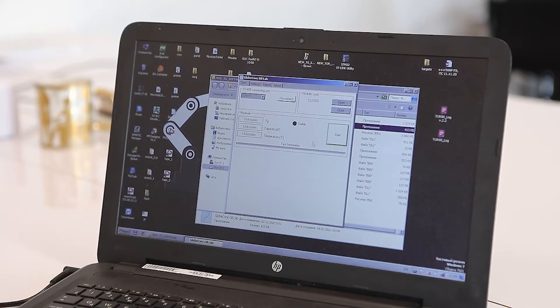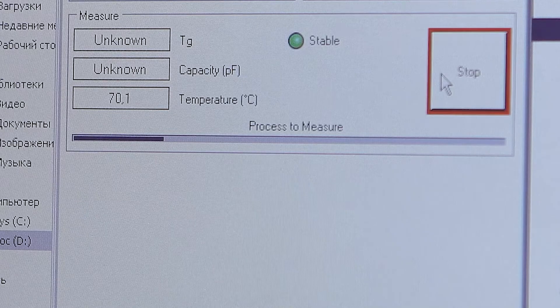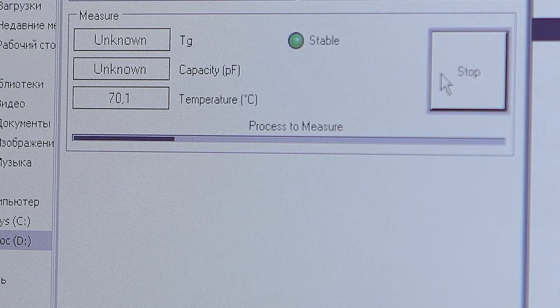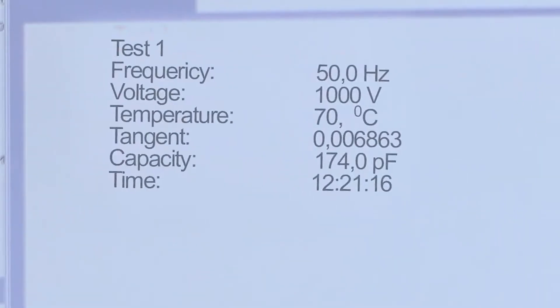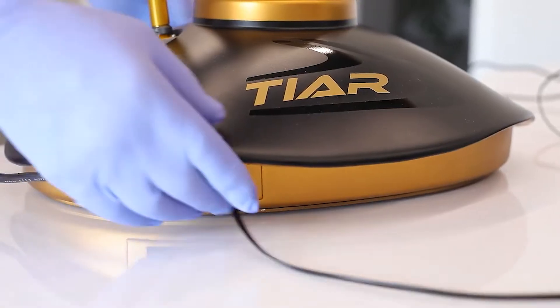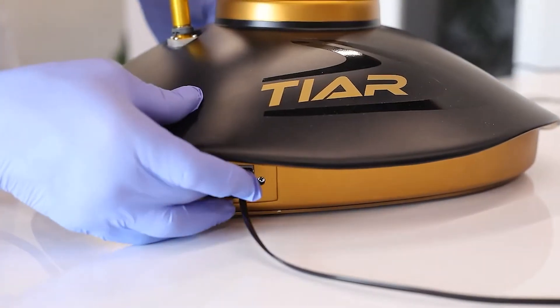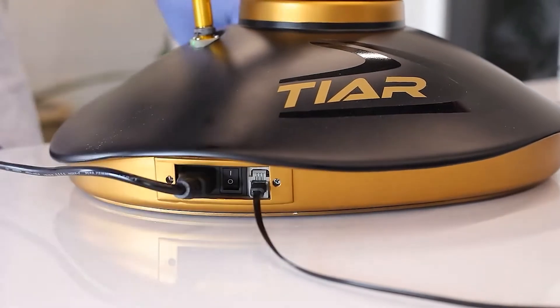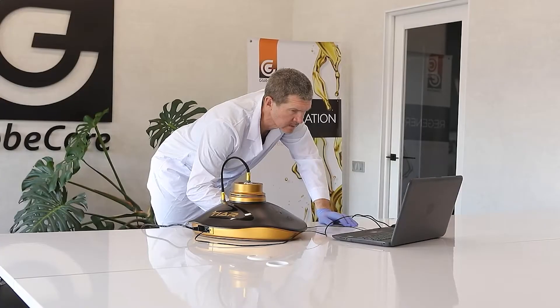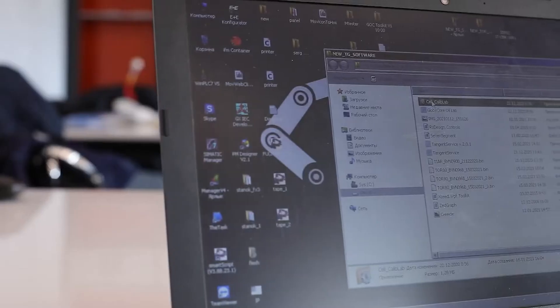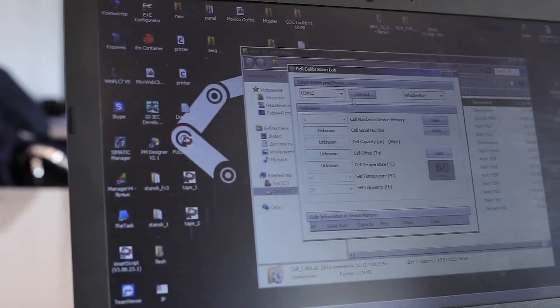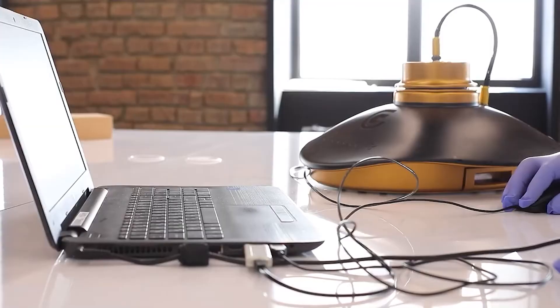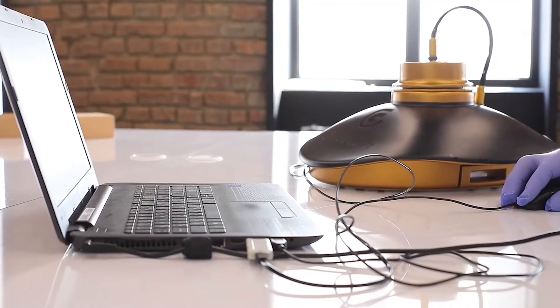The TOR-3 device is controlled by a computer, which commands certain actions that are made in automatic mode, with results output to the computer. After connecting the device to the mains, a command can be sent to the unit to begin measurements, which are usually performed with oil at 90 degrees Celsius.